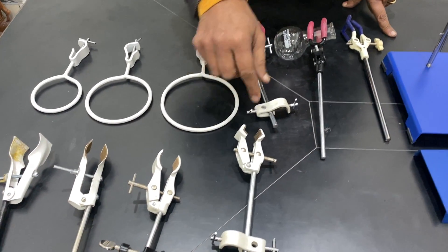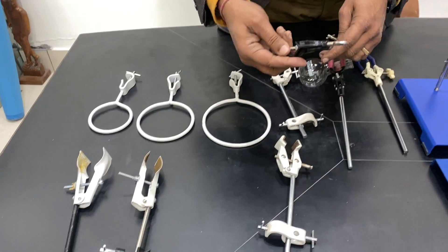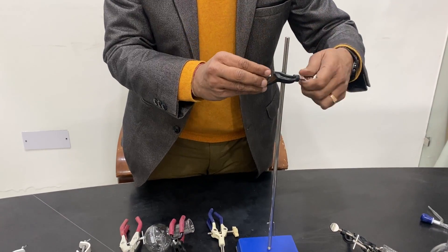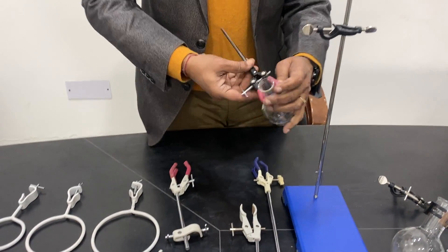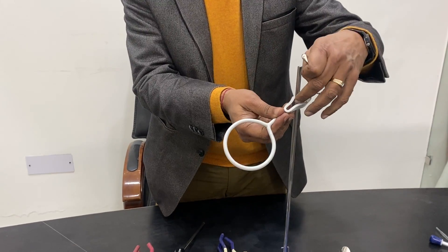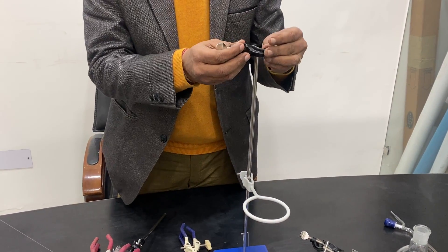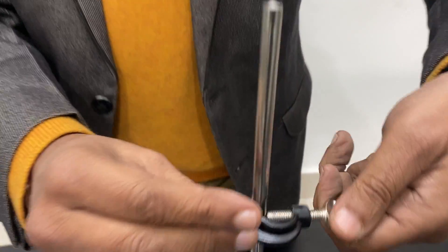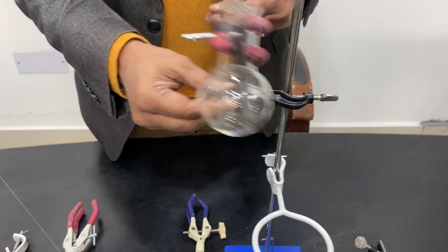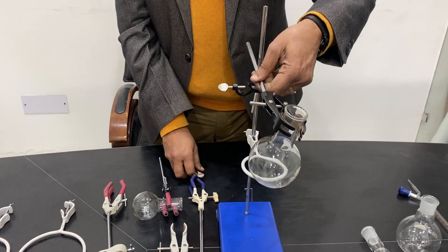These are called boss heads. One type is the steel strip boss head and another is the die cast boss head. Each has two parts, and you can insert the rod from this section either this way or the other way. Most people use it on the top side. Here is how to fit it — there is a ring with a hole, fitted like this, and then I tighten it. I can then fix a larger flask with a condenser using the boss head.